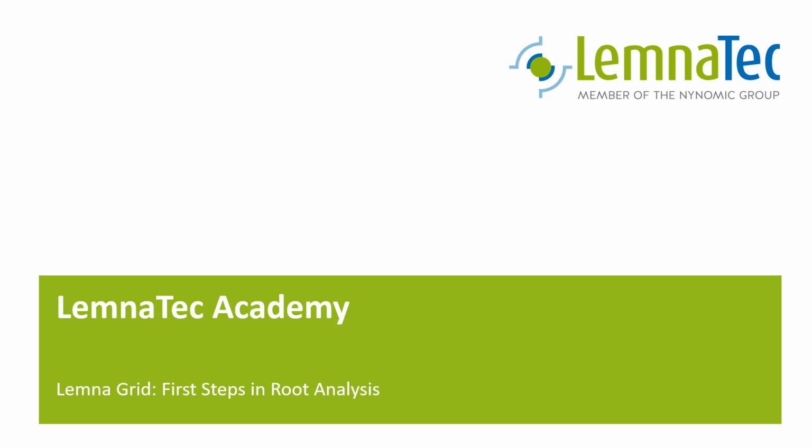I will explain how to create such machine learning models in class 6. For now, we assume this has somehow been provided to us. But now let's get into it. This video is the first of a mini-series about analyzing roots recorded with LemnaTec equipment. Originally, I planned it to be one video, but 45 minutes would be too much for a single video, so I split it into 4.